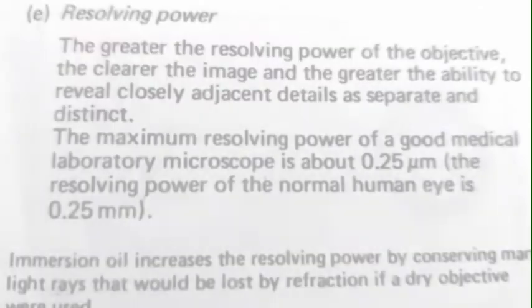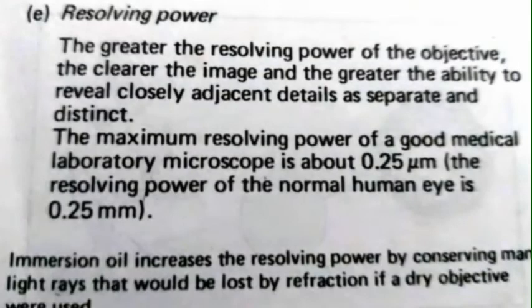E. Resolving power. The greater the resolving power of the objective, the clearer the image and the greater the ability to reveal closely adjacent details as separate and distinct. The maximum resolving power of a good medical laboratory microscope is about 0.25 micrometer. The resolving power of the normal human eye is 0.25 millimeter.